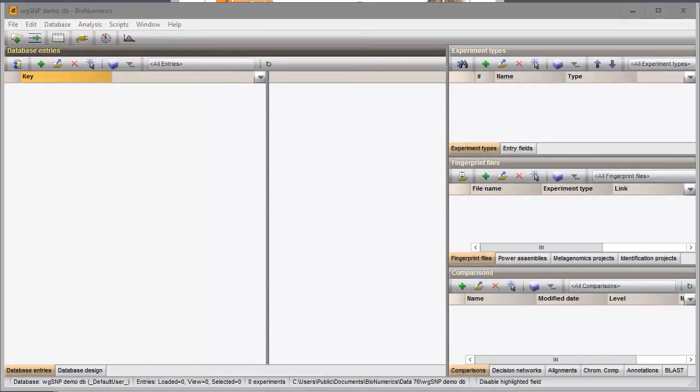In this video, I will demonstrate how to import sequence reads in your Binumerics database.